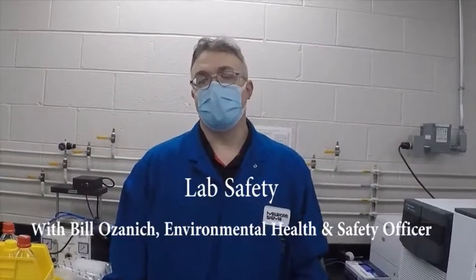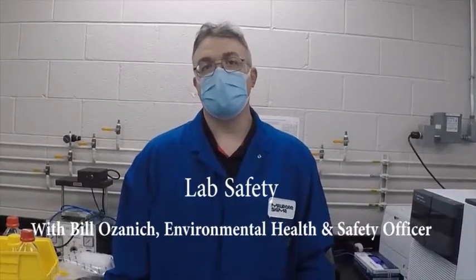Hello, my name is Bill Ozanek. I'm the EH&S manager here at the Millipore Sigma Belmont site. Today I'll be discussing with you some aspects of safety in your analytical laboratory.